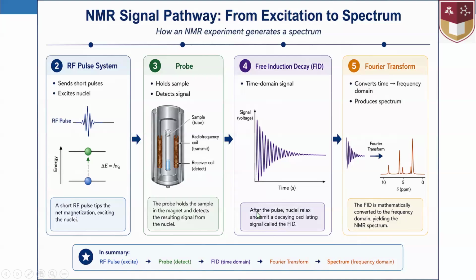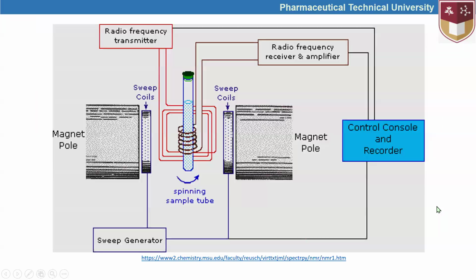So then we can identify different hydrogen atoms in each NMR that belong to various functional groups. By using this kind of radio frequency, changing radio frequency, or turning on and off mode, we can transmit and receive in the detectors different emissions. We can observe free induction decay, which is further turned into this kind of signals, and then we are able to identify different atoms in the compounds.